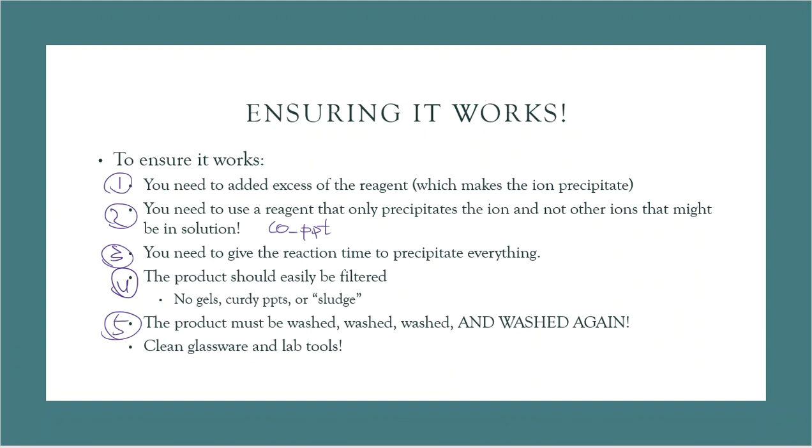You thought your speakers were messed up? You thought it was a buffering problem? No, because you need a wash. It has to be clean. You have to soak it and douse it with deionized water. And if not, all of that other crud is going to stay behind. And the whole point of this is to get a mass. If you do not rinse your precipitate out very, very well, what you will end up with is the precipitate that you want, plus all of the other cruddy stuff that didn't get through the filter paper because you didn't wash all the way through. Get it?